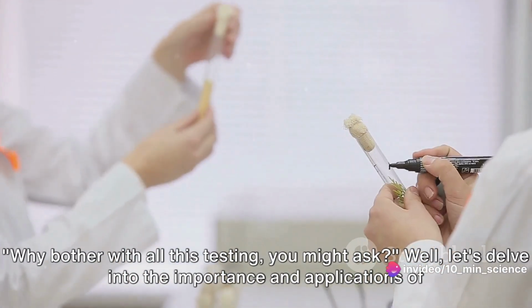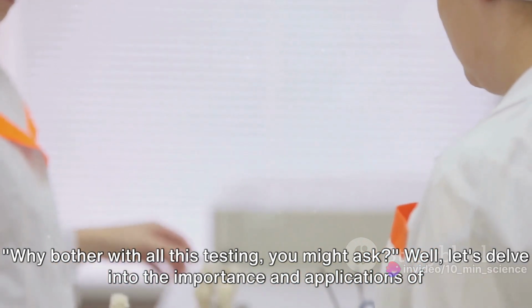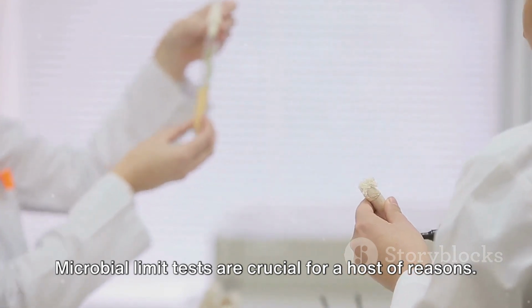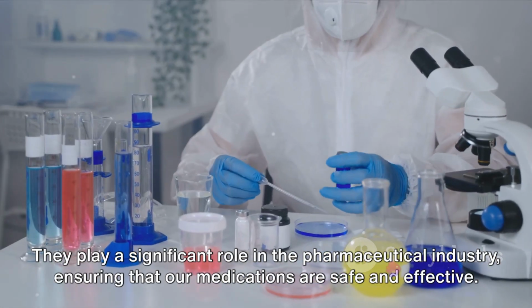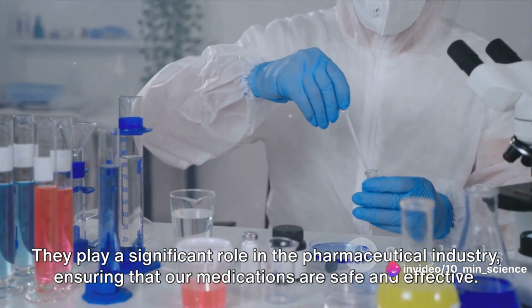Why bother with all this testing, you might ask? Well, let's delve into the importance and applications of microbial limit tests. Microbial limit tests are crucial for a host of reasons. They play a significant role in the pharmaceutical industry, ensuring that our medications are safe and effective.